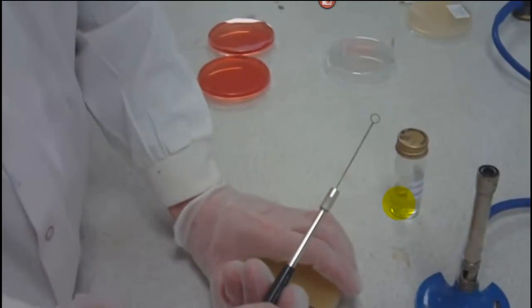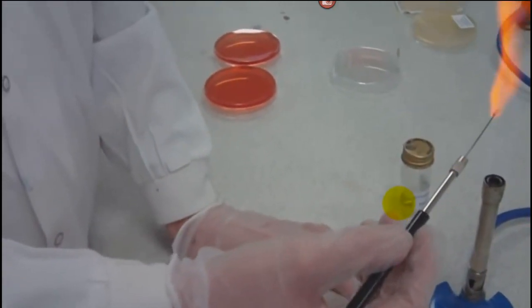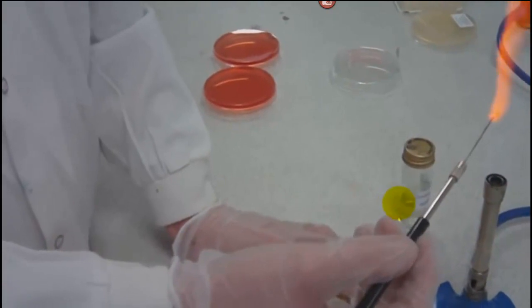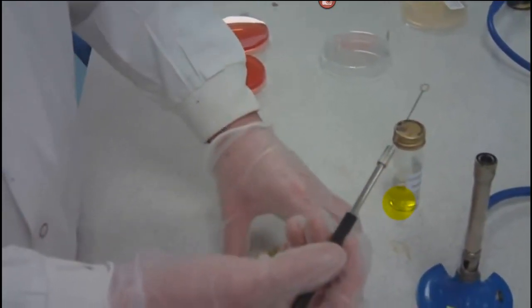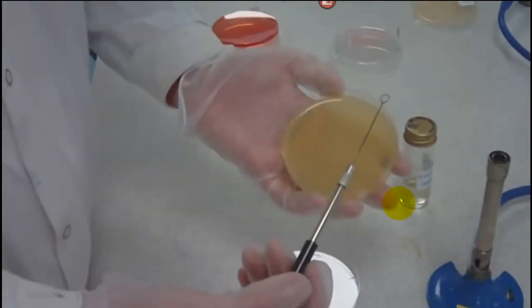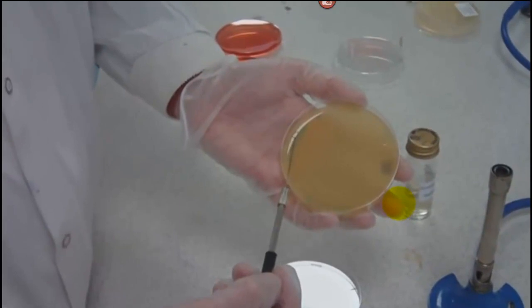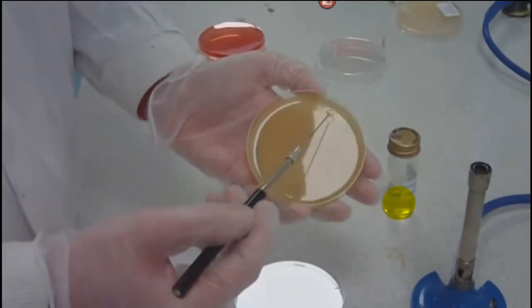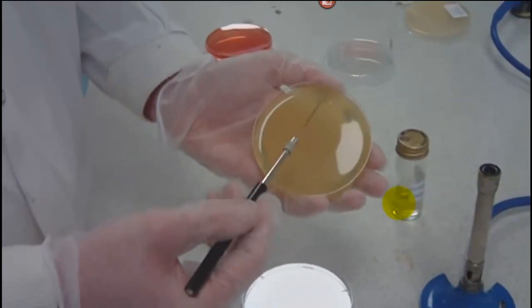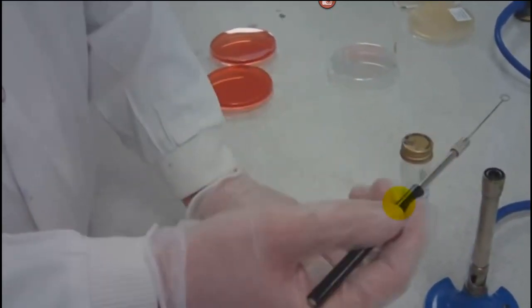And he did. If he would have streaked it down the middle, that's a simple streak. He just made a little small area. You do that as well if you want to do little quadrants in your plate. And he put those microbes on there. And it looks like he's doing a streak for isolation. So he's now going to make another streak that goes into his initial streak like that. You see how he's going back and forth? That's how you streak a plate.